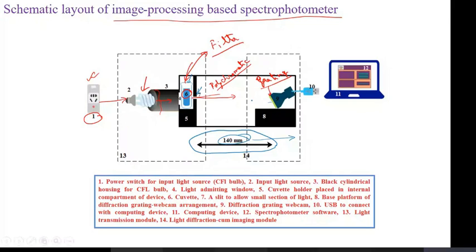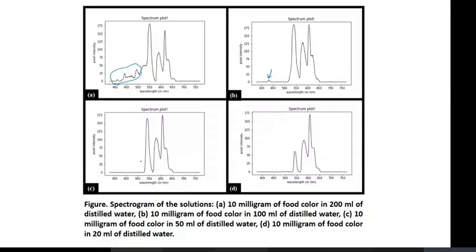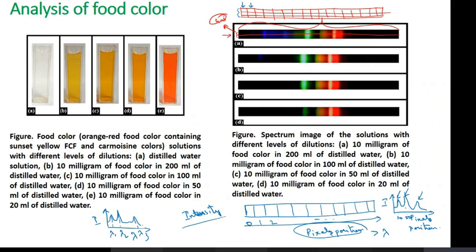Now once you have done this, you see at the lower wavelengths we have the blue components, and as we have increased this blue component, see, it has decreased. Here it has been completely suppressed. Here it has been completely suppressed. Another important thing, if you see the intensity of this one, 150, it has increased over here. It is increased further over here. It has further increased over here. So what is the last peak? If you see the reddish color, it is showing an increased intensity. The initial one had a lower intensity, and as you go on, you get a larger intensity. Okay.